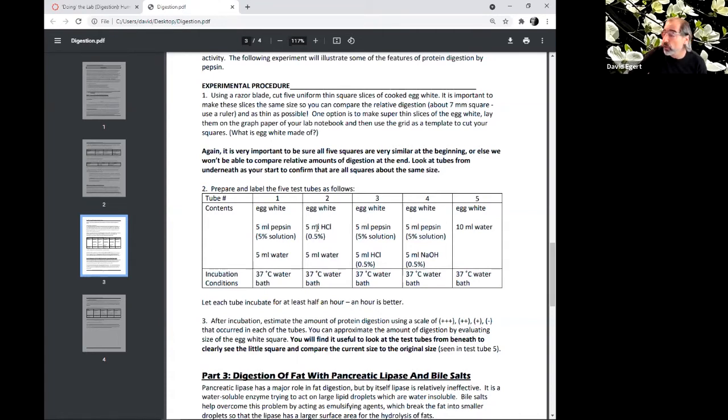What about the egg white and just in acid? So this is really weak acid. This is like diluted vinegar, basically. Obviously, if you take some concentrated acid and put something in there for 6 hours, it's going to start hydrolyzing the bonds and stuff.